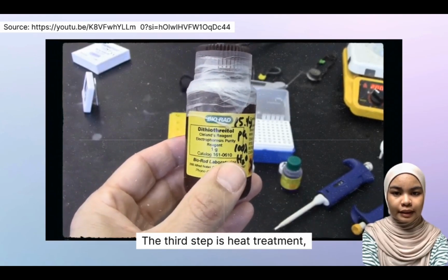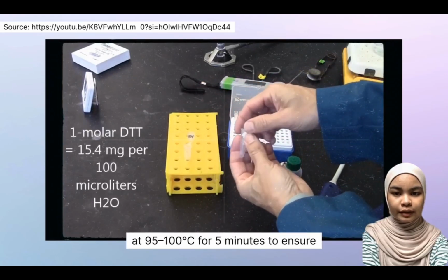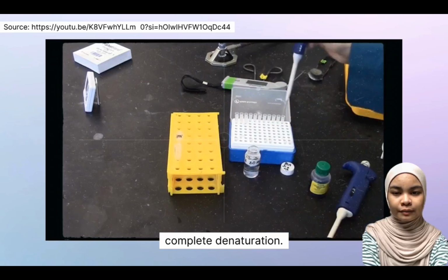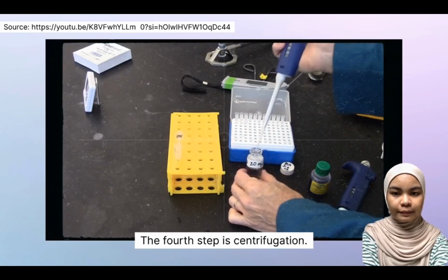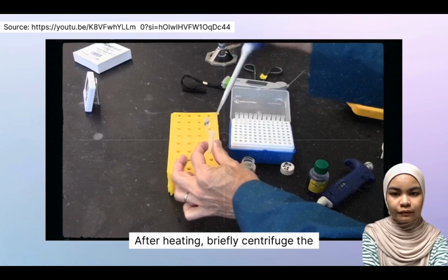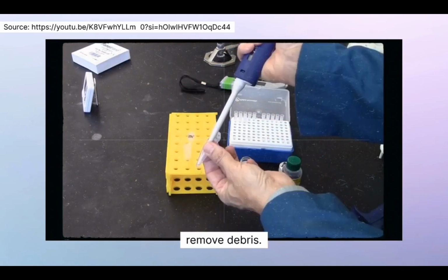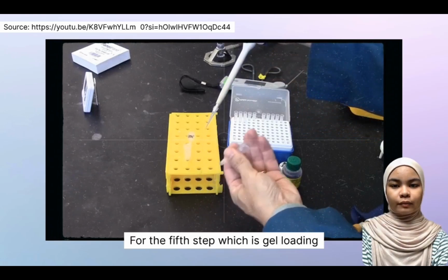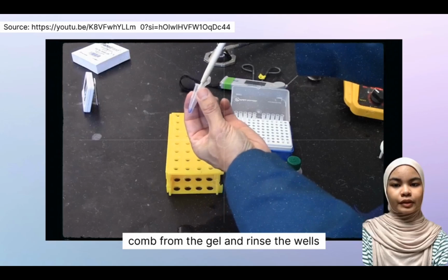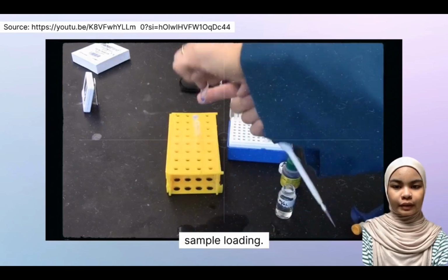The third step is heat treatment. Incubate the sample at 95 to 100 degrees Celsius for 5 minutes to ensure complete denaturation. The fourth step is centrifugation. After heating, briefly centrifuge the sample to collect condensation and remove debris. For the fifth step, which is gel loading preparation, carefully remove the comb from the gel and rinse the wells with running buffer to ensure proper sample loading.